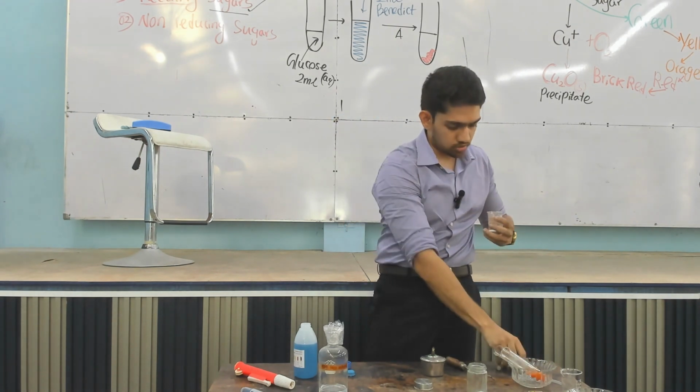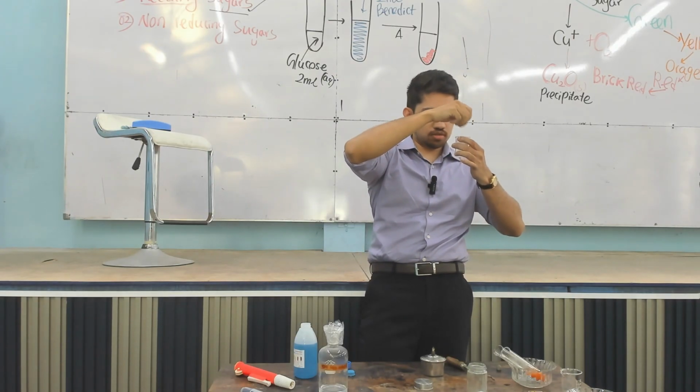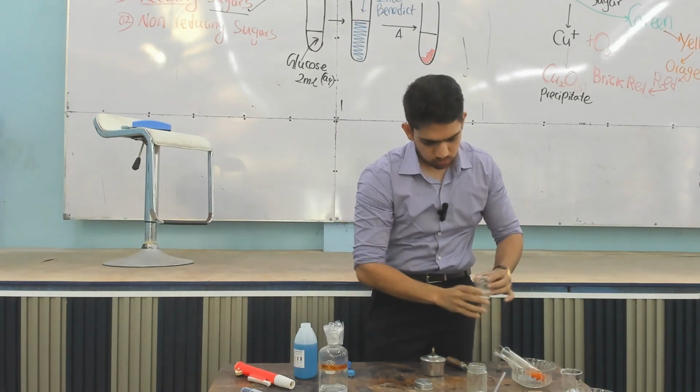Let's try to resolve this even more. Okay, so protein test. All right. Any questions? Okay.